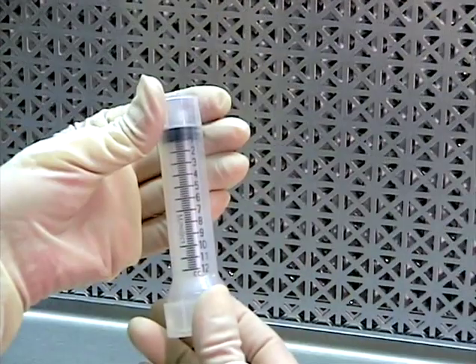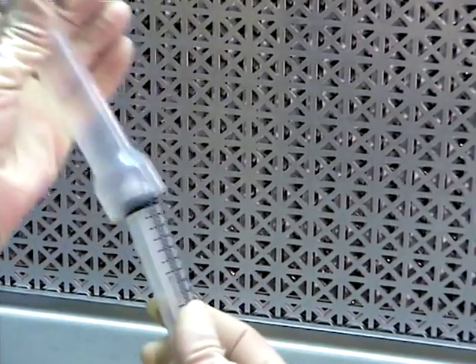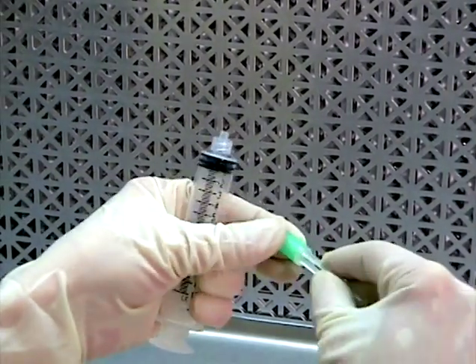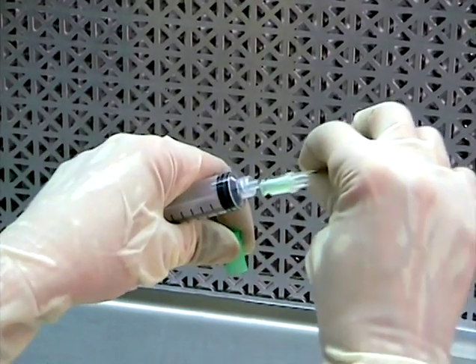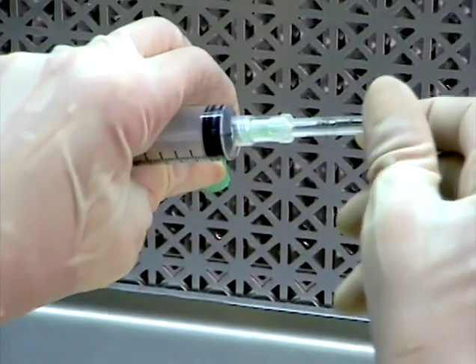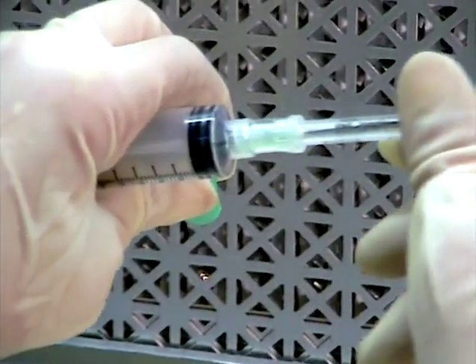For all other packaged systems, first open the syringe, making sure the exposed tip is maintained in first air. Proceed with opening the needle using the thumb and index finger of the syringe hand. Bring the needle and syringe together in first air and secure the needle to the syringe by twisting gently to activate the lock.